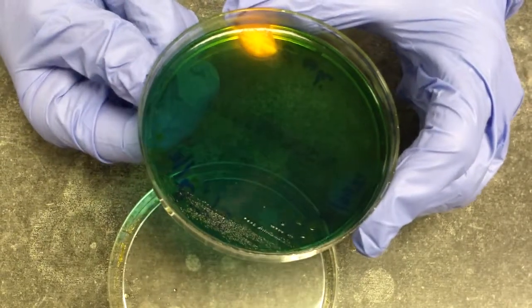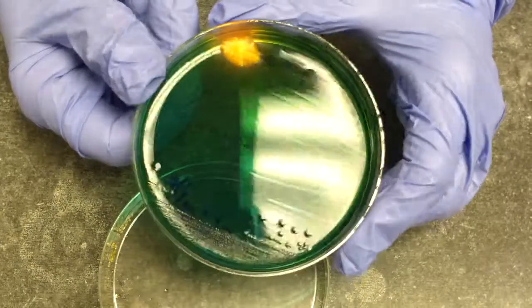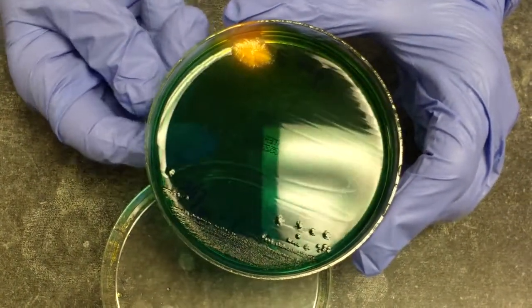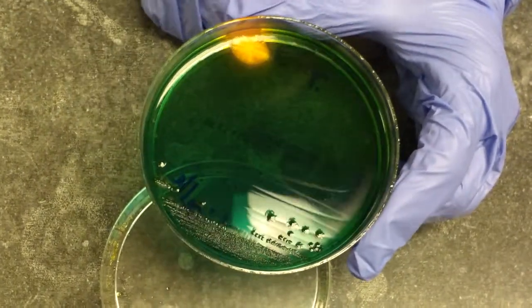The HE agar also has a component that will show us when an organism produces H2S, and that organism will also have black precipitants in the clear colony, such as salmonella.